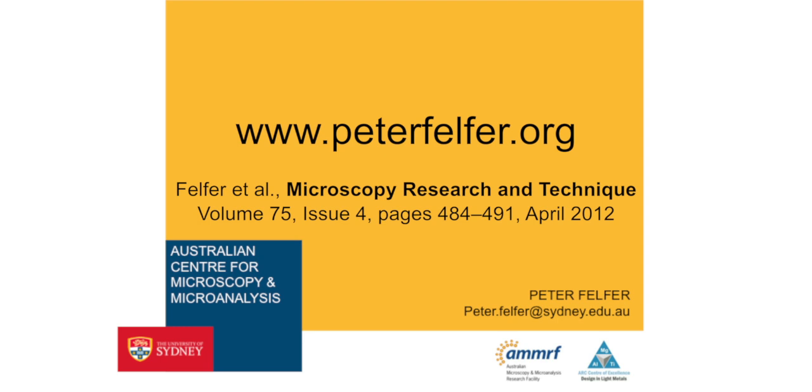Settings work very well. Of course, they're only honed on the standard settings. So this means you have a platinum gas injection source, and that's the basics you work with. But that's probably what most of you out there will have anyway.